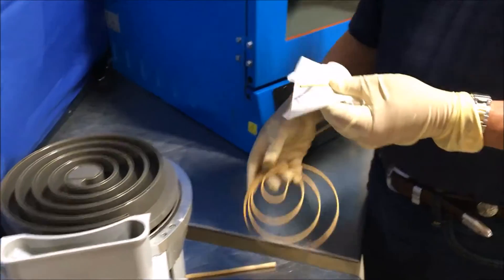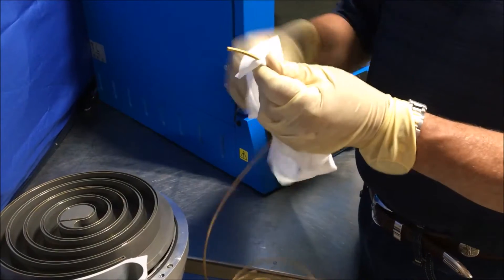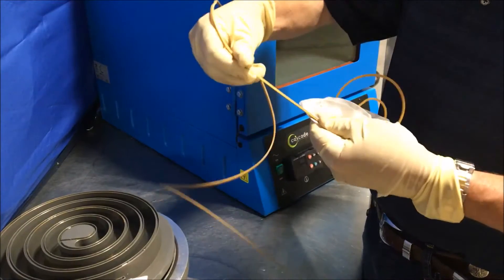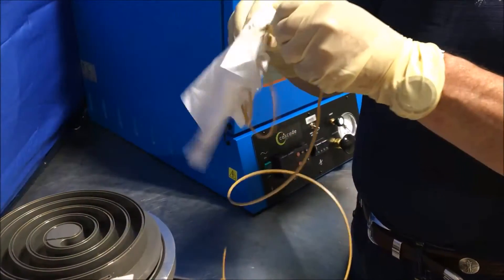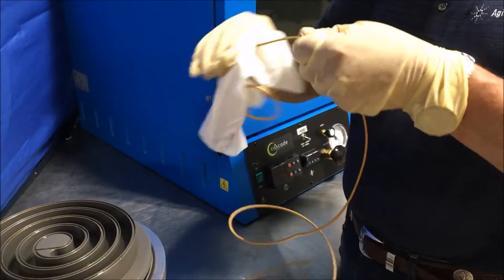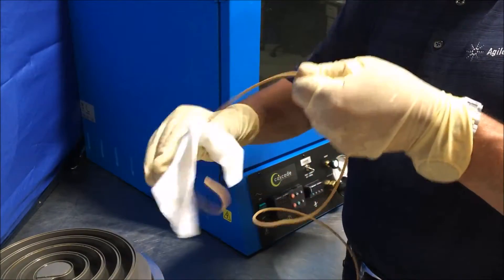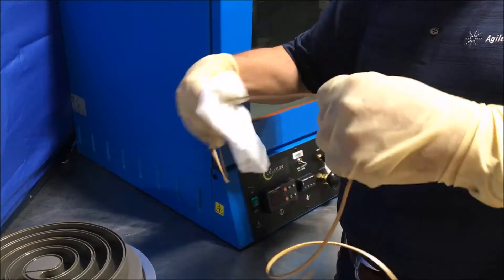We use the same procedure to clean the tip seals themselves. Use the Everclear, pour it onto the lint-free cloth, and clean the tip seals of as much debris as you can. The farther down to the inside of the pump, the more you'll feel buildup of debris on the tip seals. The Everclear does a good job of removing this — just run that cloth along the tip seal and you'll feel it smoothing out as the debris is removed.